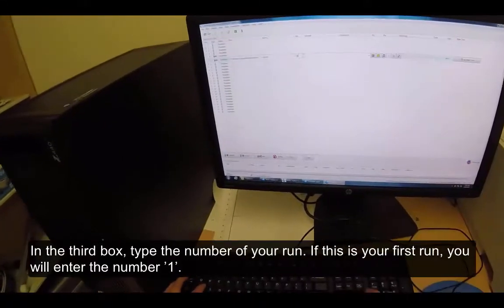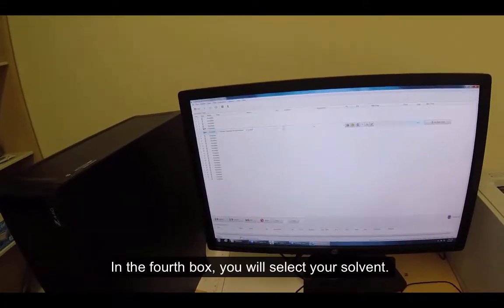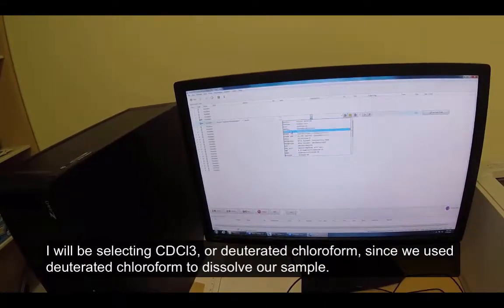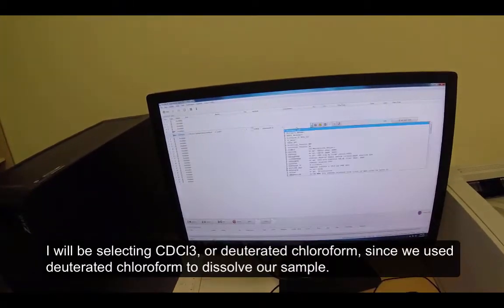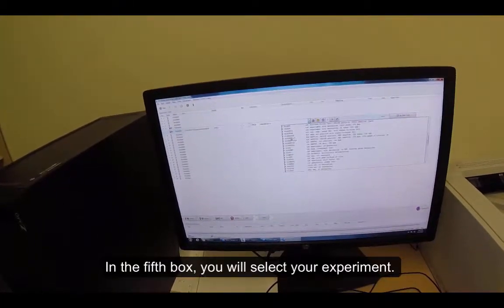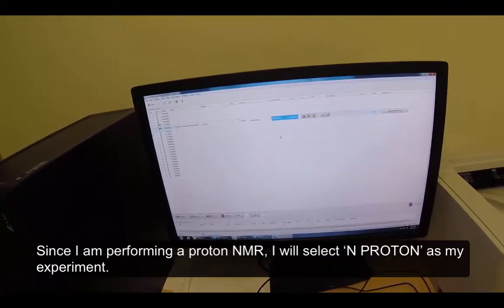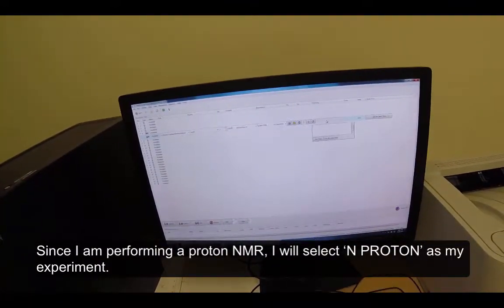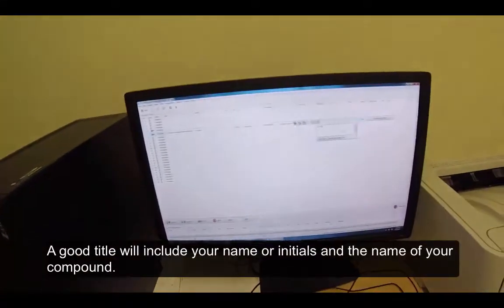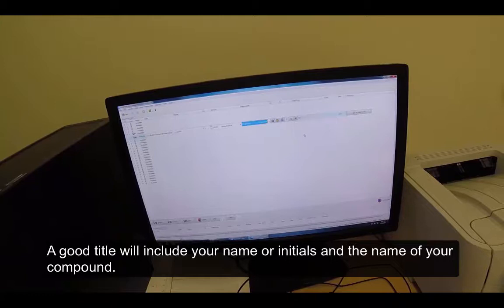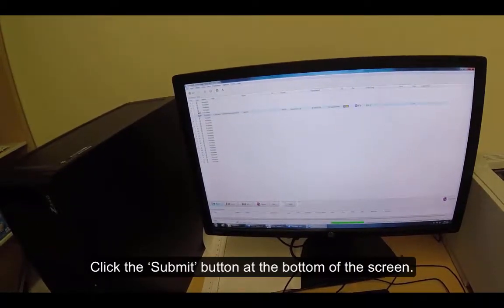If this is your first run, you will enter the number 1. In the fourth box, you will select your solvent. I will be selecting CDCl3, or deuterated chloroform, since we used deuterated chloroform to dissolve our sample. In the fifth box, you will select your experiment. Since I am performing a proton NMR, I will select N PROTON as my experiment. Double click on the title box and add a title. A good title will include your name or initials and the name of your compound.